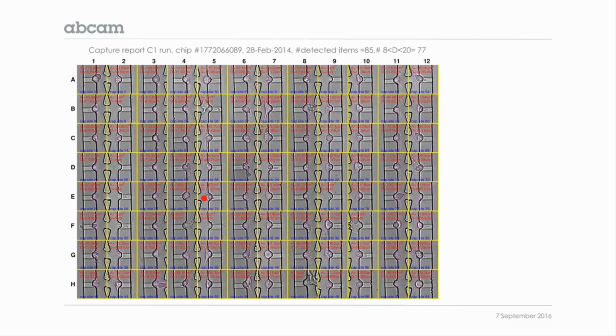So basically, the measurement is gene expression. That's all. But of course, gene expression contains a lot of information. In this kind of platform, and this is just one example of a platform for single-cell RNA-seq, one can also image the cells with a standard epifluorescence microscope, so you can get the bright field that tells you the shape and the size, and any other fluorescence channel.